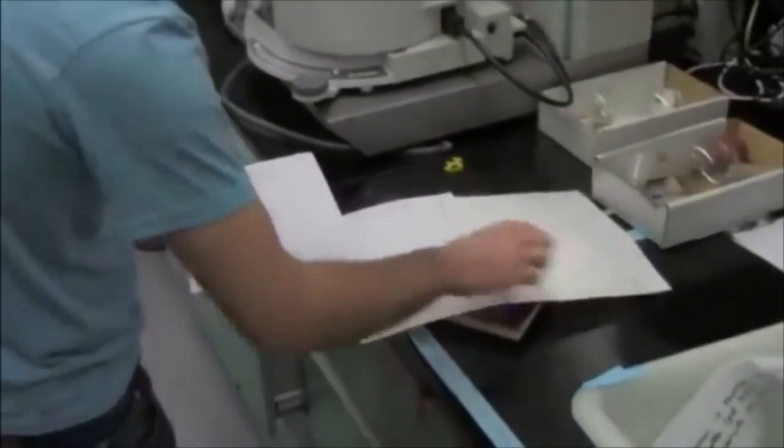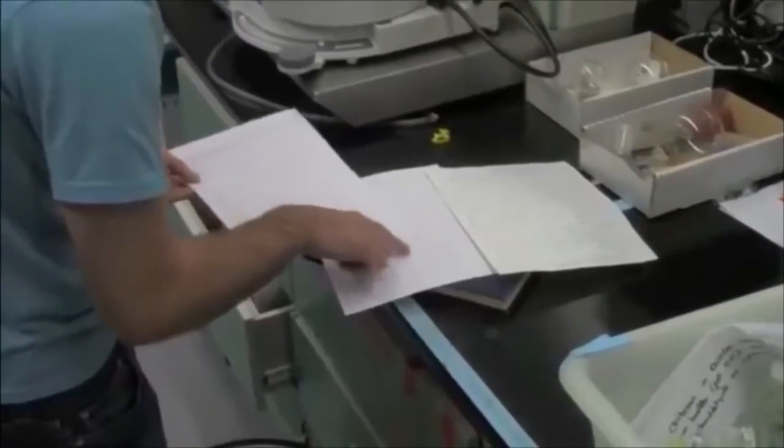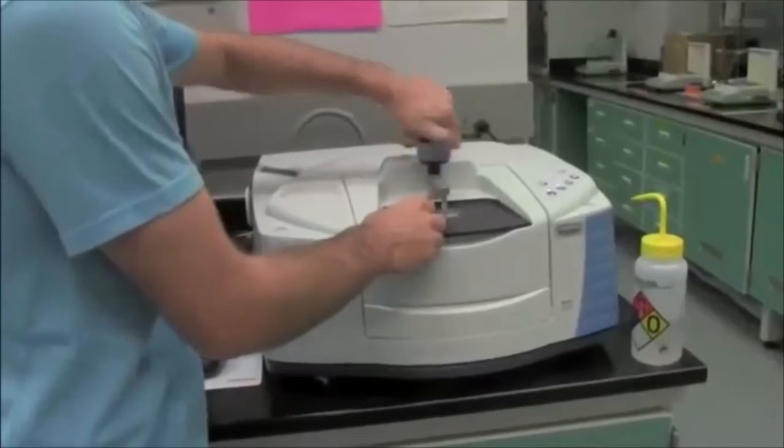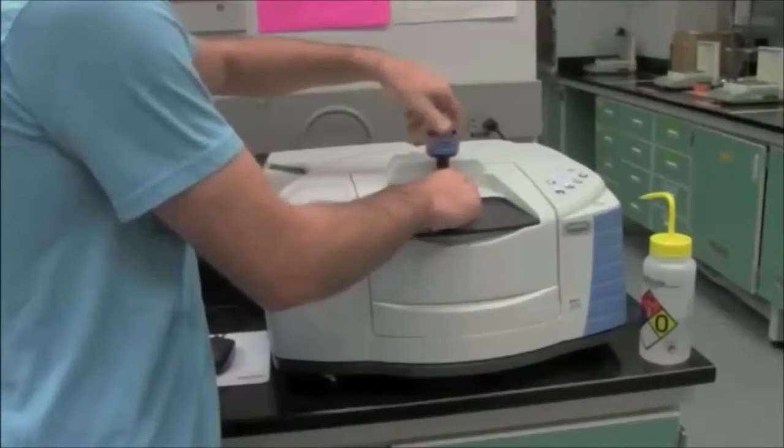In order to analyze an FTIR spectrum, the absorbance and transmittance of certain functional groups can be looked up in references, and/or the spectra can be directly compared to previous spectra recorded in references. Now the sample should be removed from the device by simply unscrewing the clamping device and disposing of the sample.